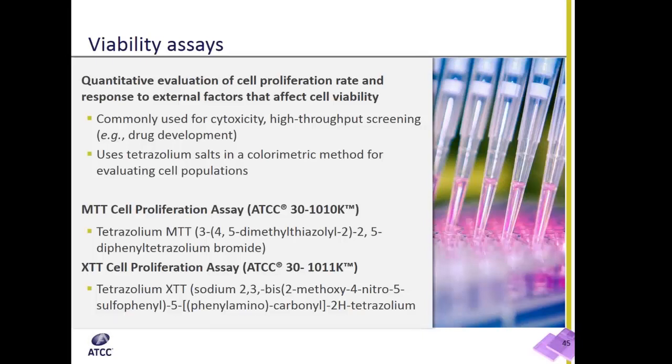Both assays utilize a colorimetric plate reader for analysis. The two assays are very similar in nature. They differ by the type of species of salt used, and it's a slightly different protocol and slightly different way of working.